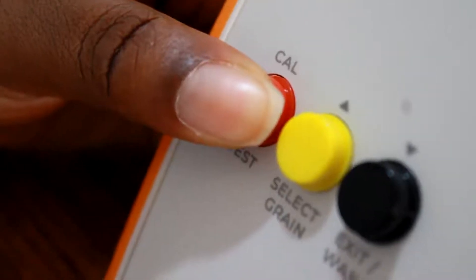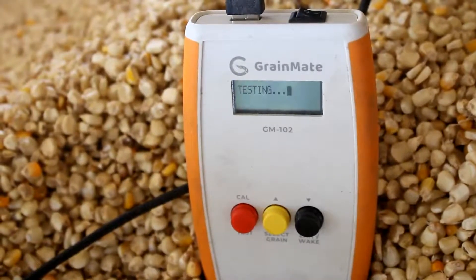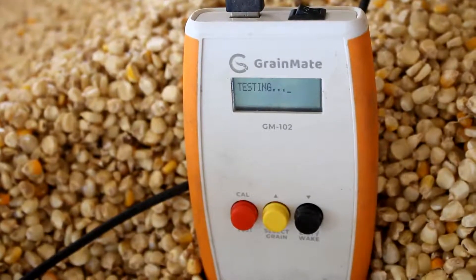Press the red test button until you hear the first beep. It's going to display 'testing' on the screen while the test runs in the background.